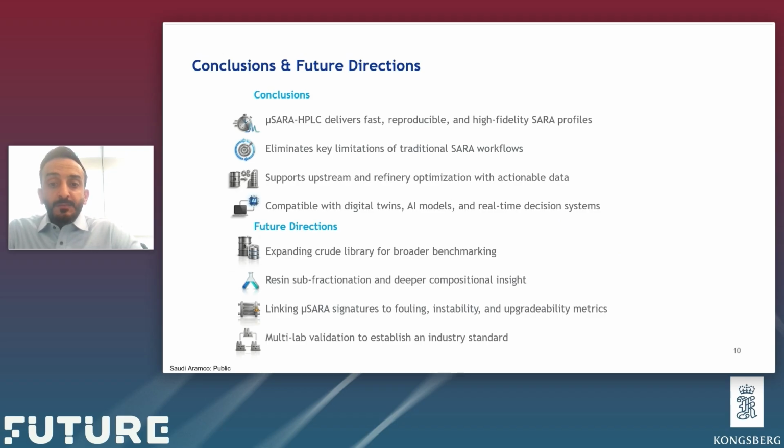Now, this brings me to the conclusion and future outlook of this approach. The micro-SARA HPLC provides a practical step forward for crude oil characterization, be it in upstream, when evaluating fluids in the subsurface near the well, or in the refinery after processing the crude.